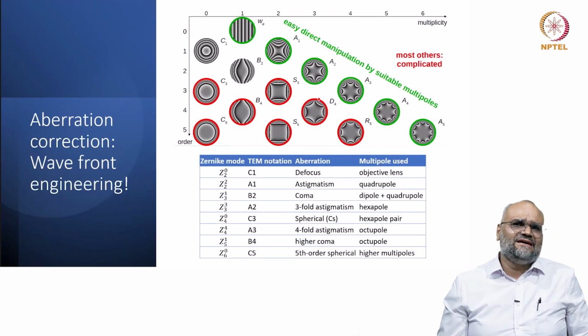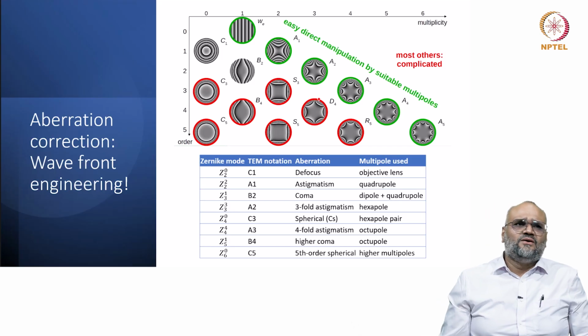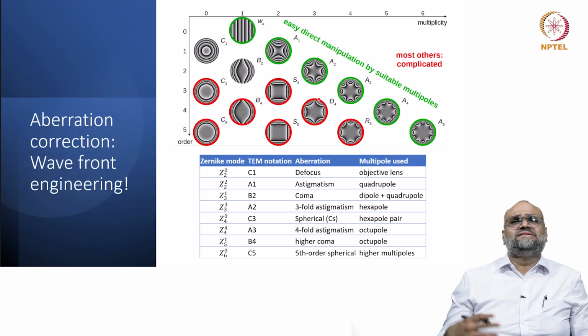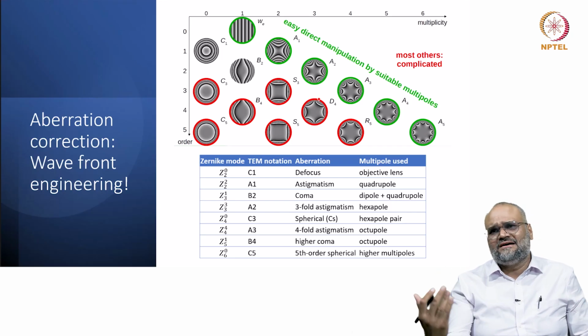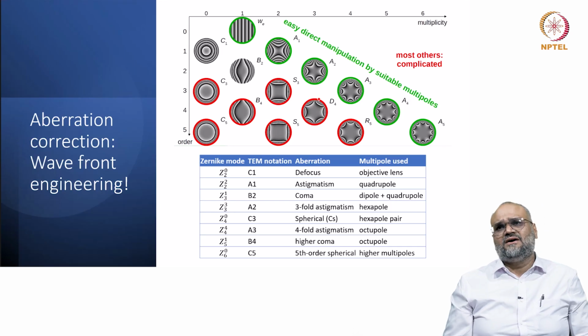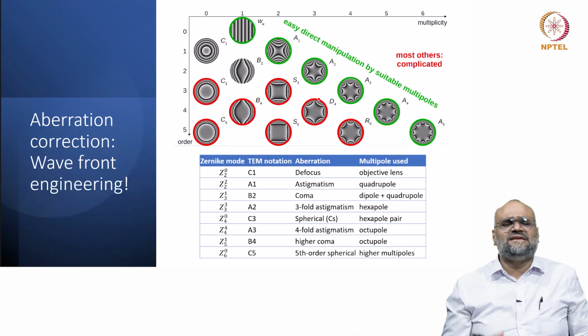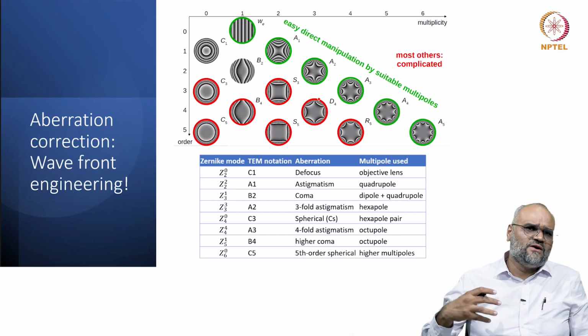minimizing the engineering defects and with the feedback controls, what people have achieved is the breaking of symmetry of the round electromagnetic lenses and the compensation of the field and introduction of a negative CS, because the round electromagnetic lenses always give you a positive CS.